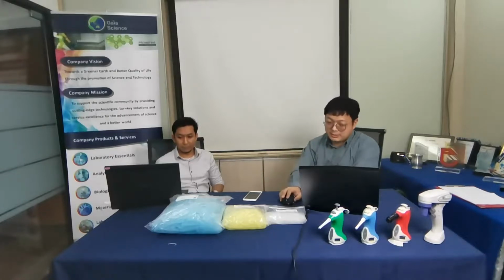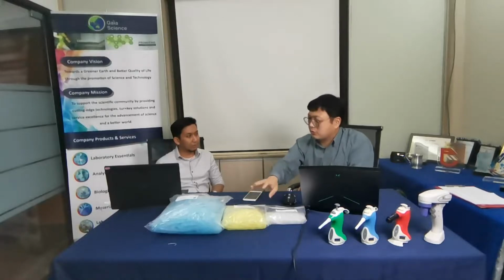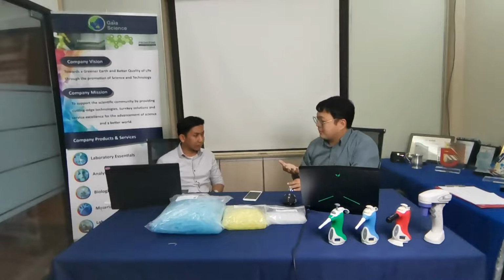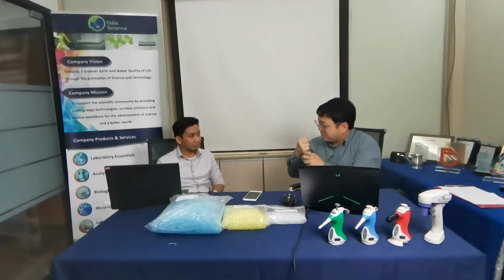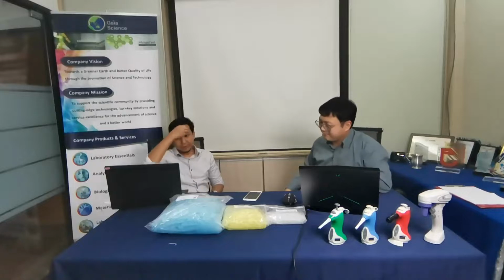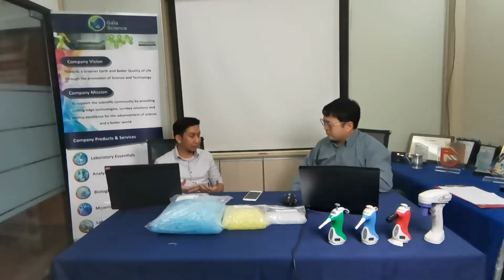I would say that normally you also want to choose a high capacity one, bigger than what you normally use on your pipette, for safety. It won't affect the amount you aspirate up and down. That is already dependent on how the tip fits. So I guess there are so many pipette tips in the market now. It really depends on the application and usage as well.